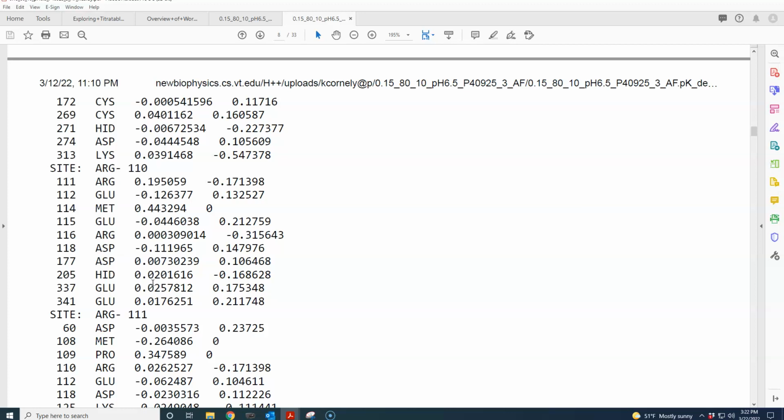So what you're going to want to do then is look at what contributions your amino acid makes to other residues, and then you'll want to look at your site itself and see how the pKa values of these amino acid residues are impacted. So again, if this is my arginine right here, how do these residues impact your mutation? Okay, so let me think of other things that I want to tell you about the data.